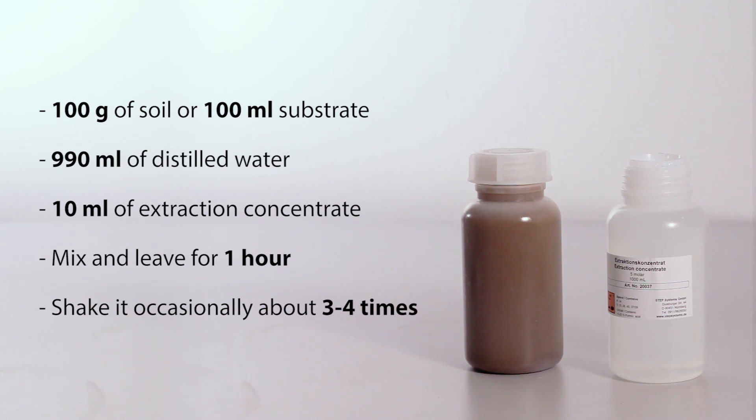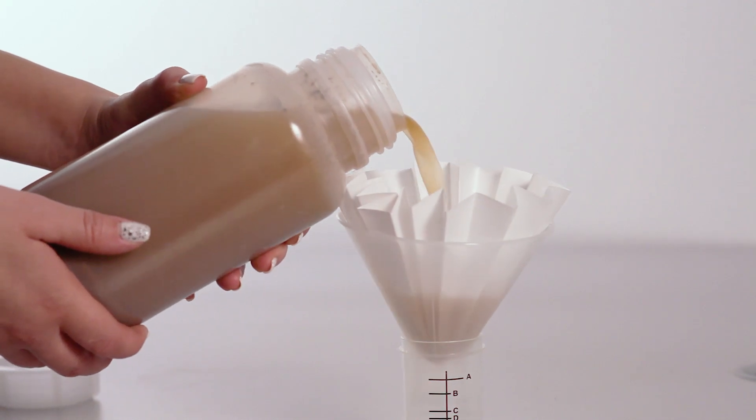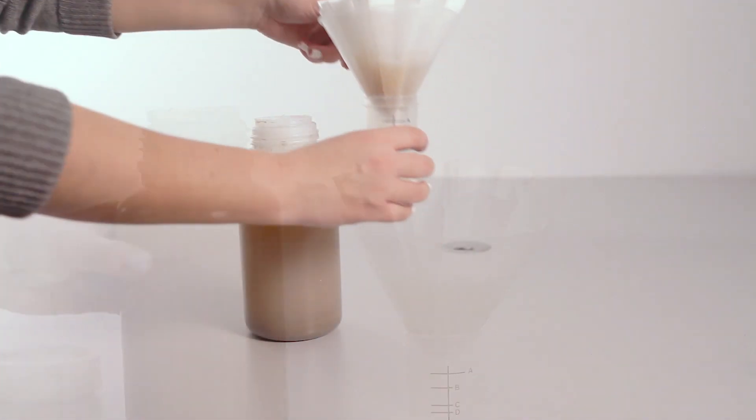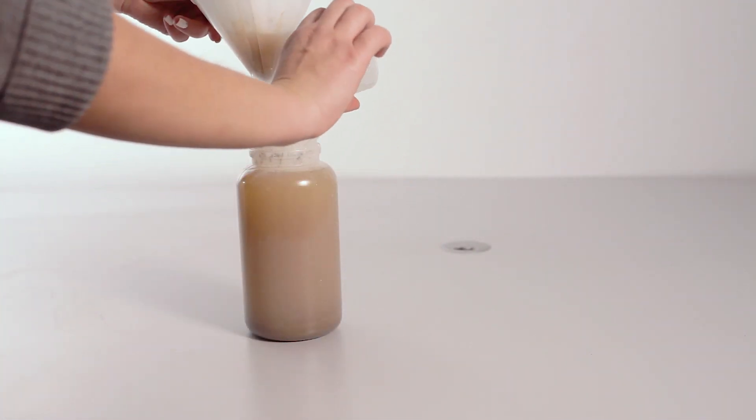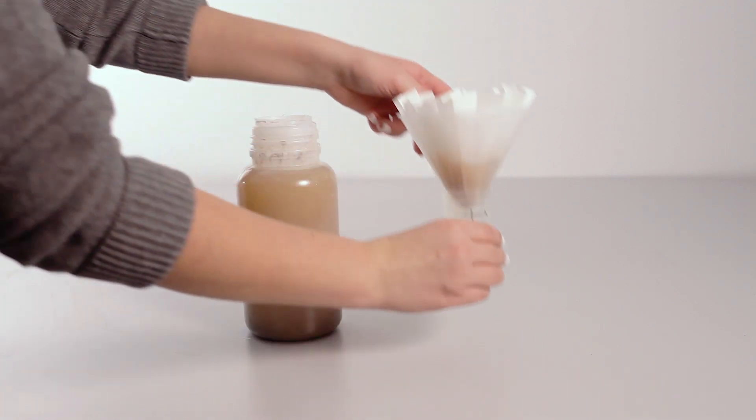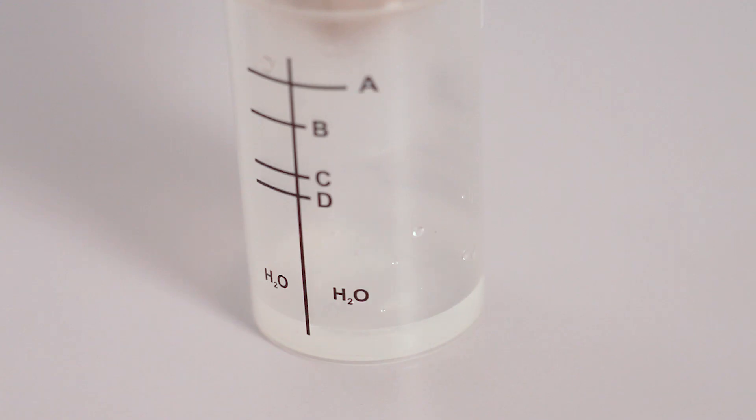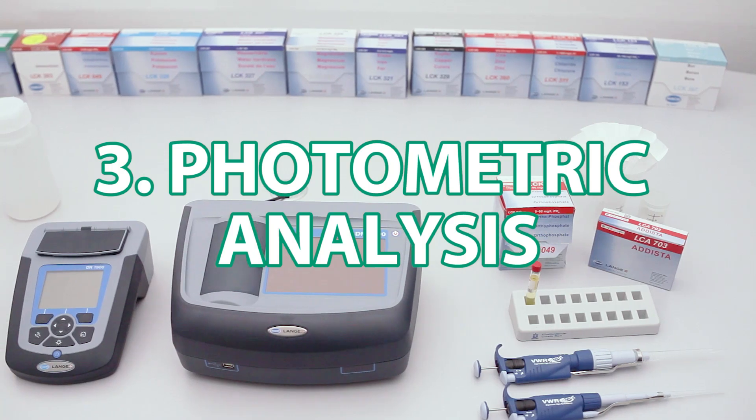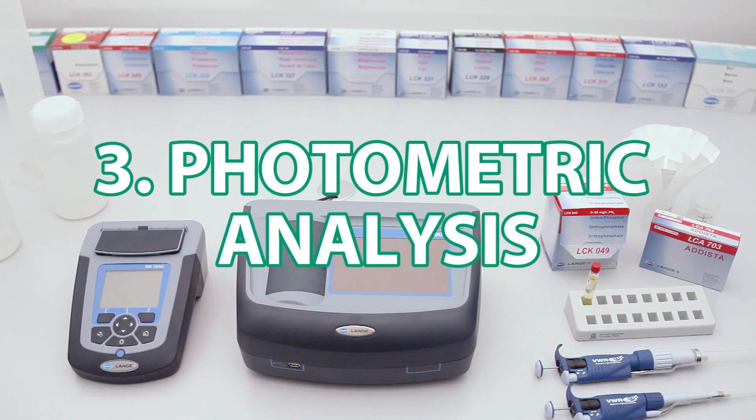After one hour, the filtration begins. The solution needs to go through the included paper filter. The first few centiliters of the filtered solution should not be used for analysis. The filtered solution must be clear and clean.